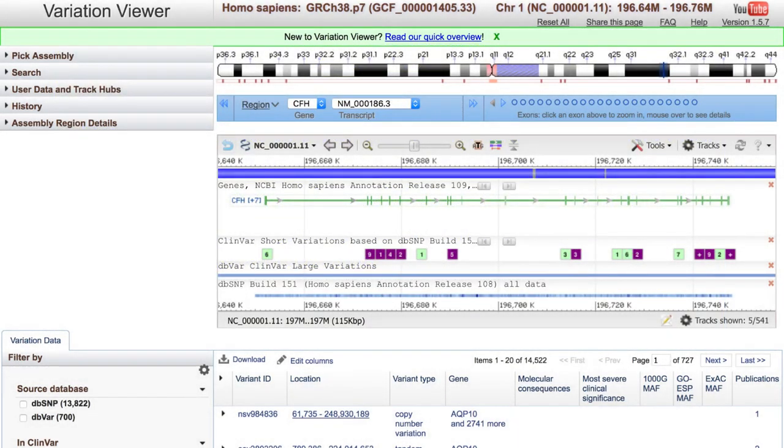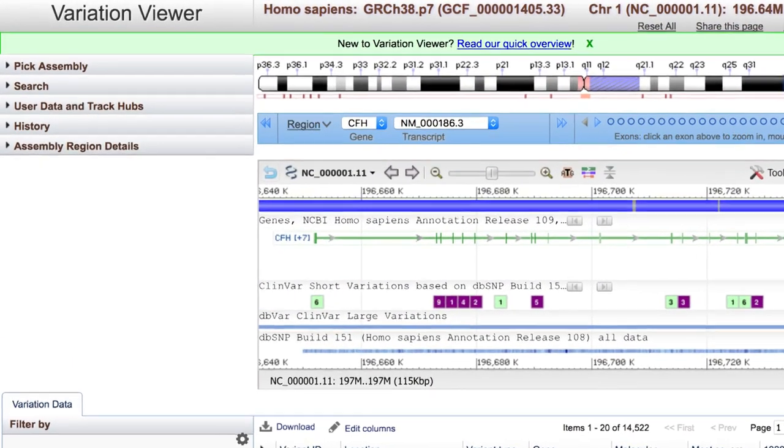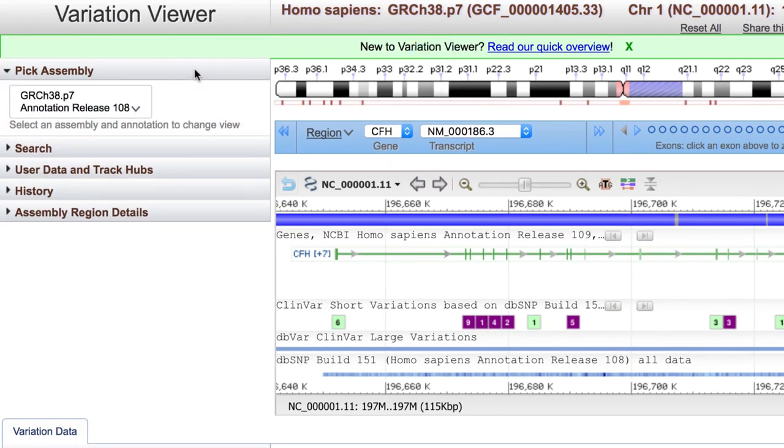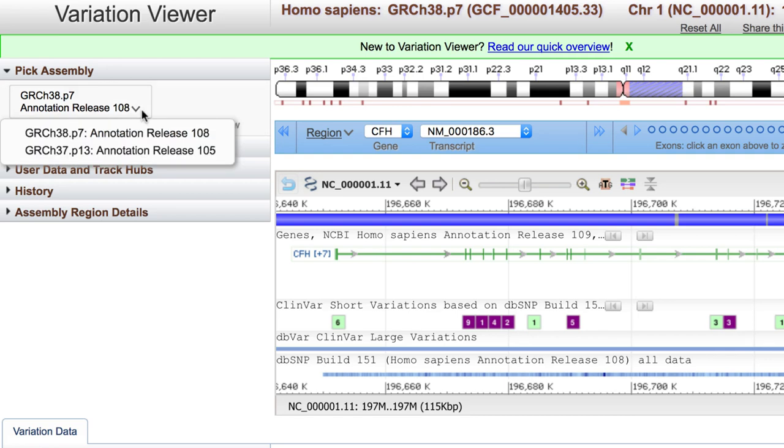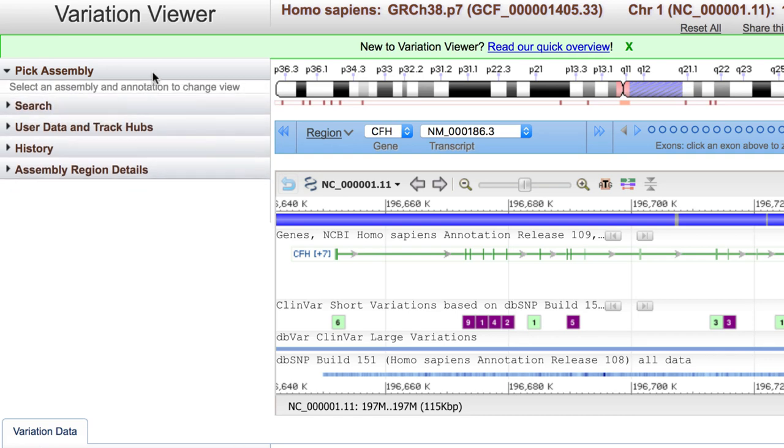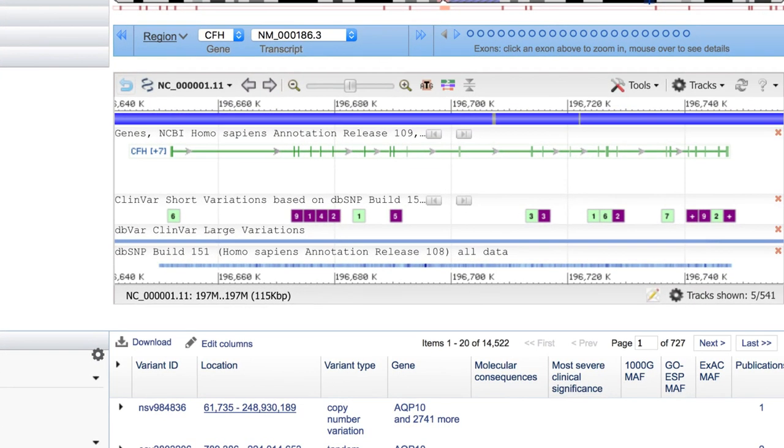I'm going to start in the Variation Viewer and Human Assembly GRCh38, but it's easy to switch to H37 right here under Pick Assembly. Let's take advantage of one of the recommended track sets, called Genetics and Variation.